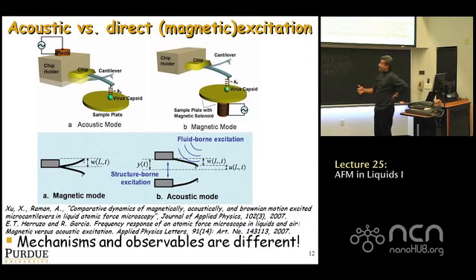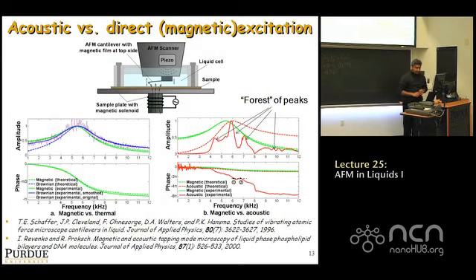So one of the problems that arises with dither-piezo excitation is how you shake the cantilever. There are two mechanisms. One is you shake the base and it moves, but as you shake the base, you're also shaking the entire chip holder assembly, the piezo, and that's moving the water around, and that water ends up moving the cantilever as well. So there's a fluid-borne path and there's a structure-borne path to the shaking that happens, okay? And I want to just end with this discussion.